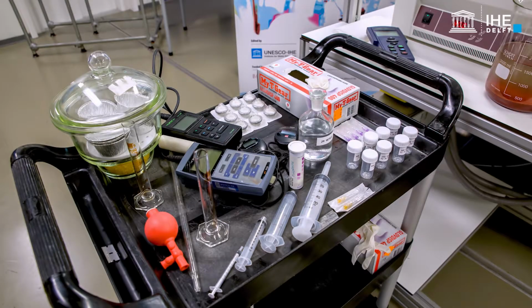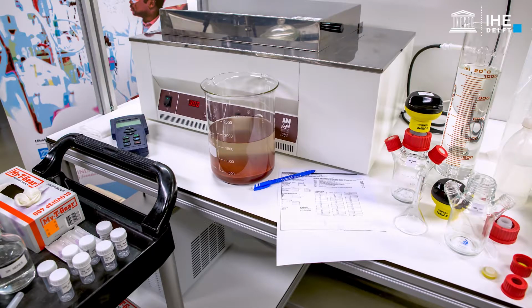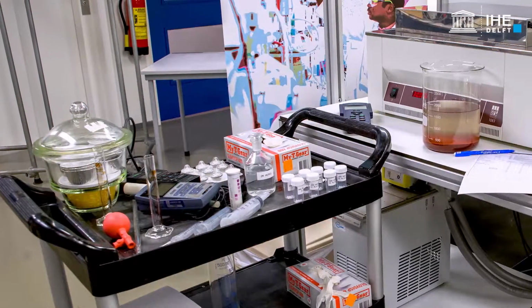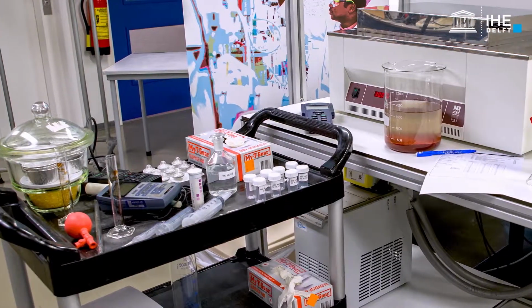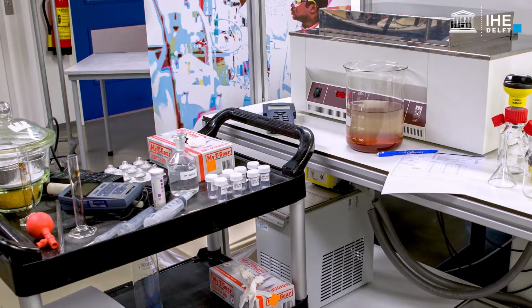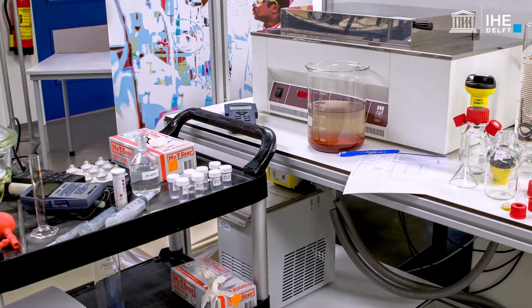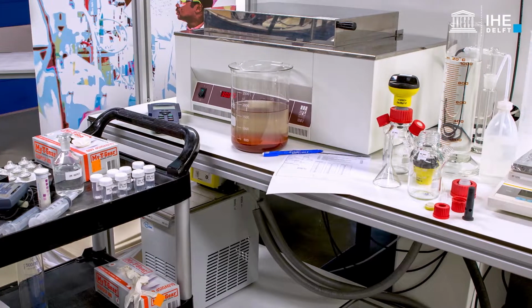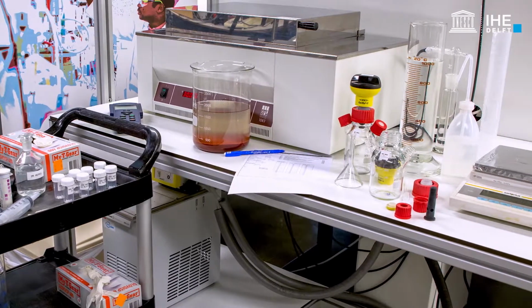Remember to verify that the portable probe was calibrated and the mixing system or orbital shaker, thermostat systems and pressure measuring devices are functioning properly. In this example, a 1.7 litre sludge sample was collected from an Anammox reactor. After the sludge has been collected, it may be washed and/or concentrated or diluted if applicable, as suggested in section 2.4.3.5 of the textbook.